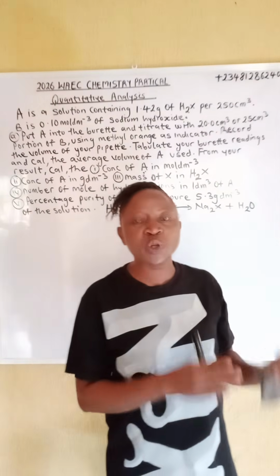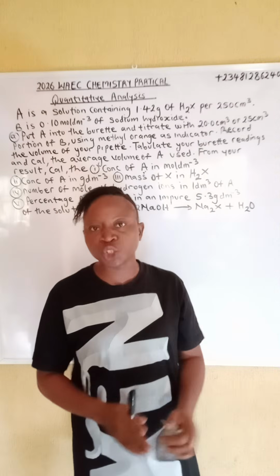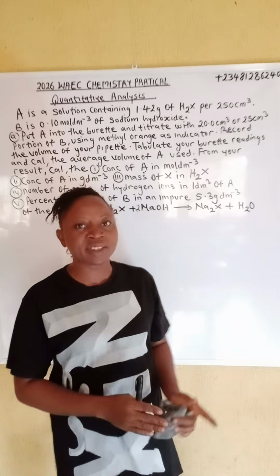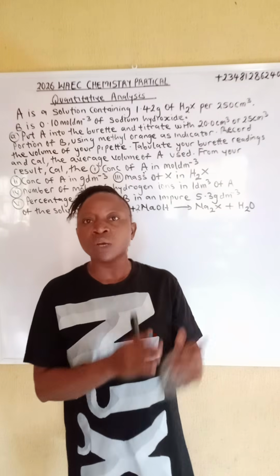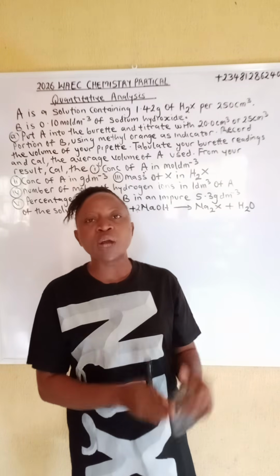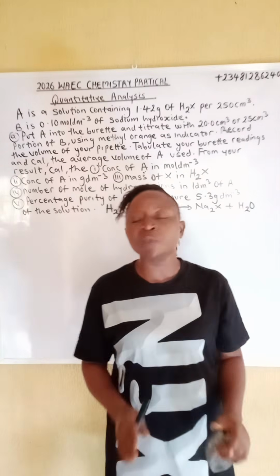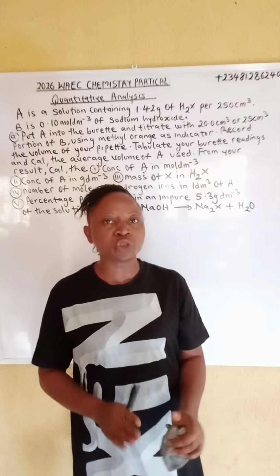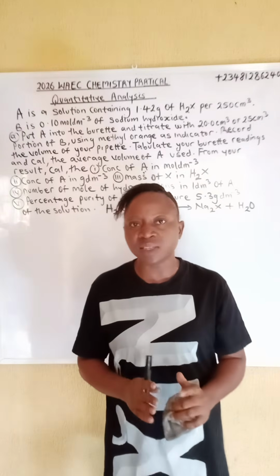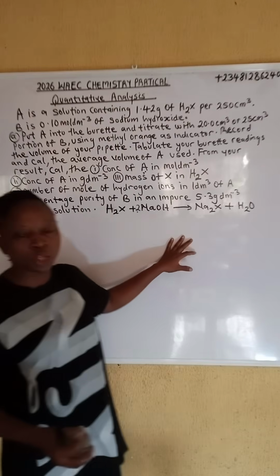In this video, we are going to be looking at the first aspect of the 2026 WAEC chemistry practical on quantitative analysis, that is titration. I've released the first video on salt analysis. So we are going to focus on quantitative analysis, and I'm going to explain all the necessary steps that need to be followed while answering questions on quantitative analysis. Then we are going to work on the following predicted questions on the board.